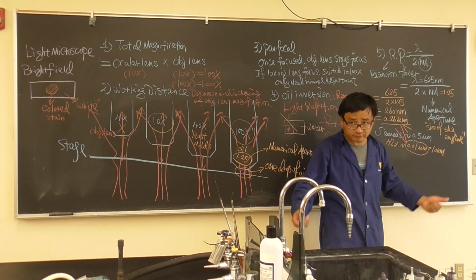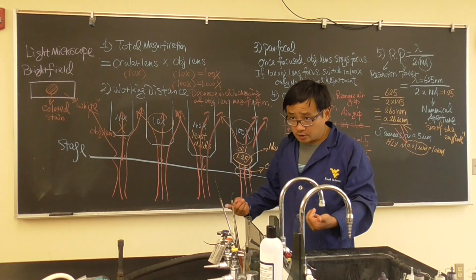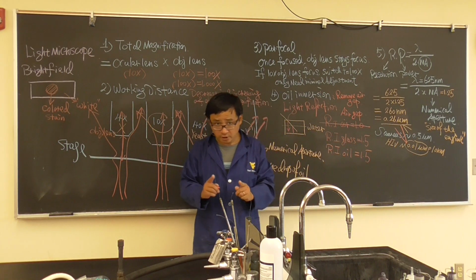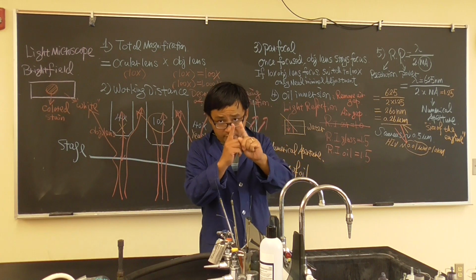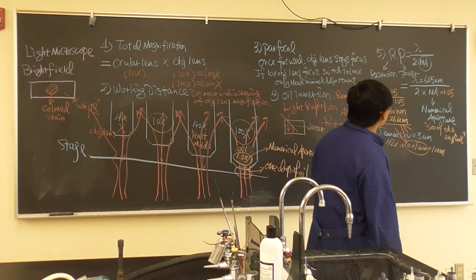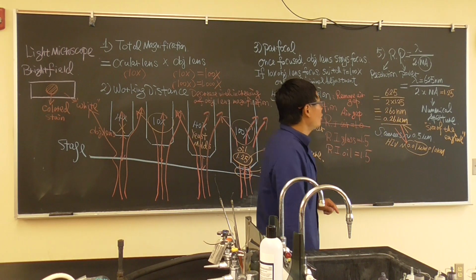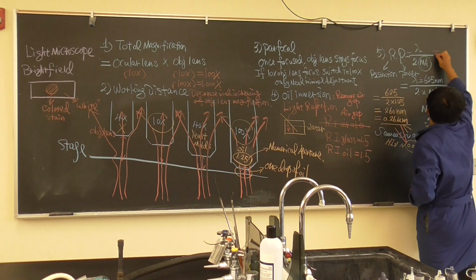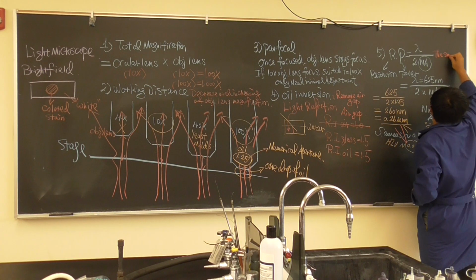What are you going to observe? The resolution power, you can say easily, is the capability to differentiate two particles when they're very close, attached very close. Okay? So always remember that. That is called resolution power. Now, obviously, the smaller the resolution power, the better.